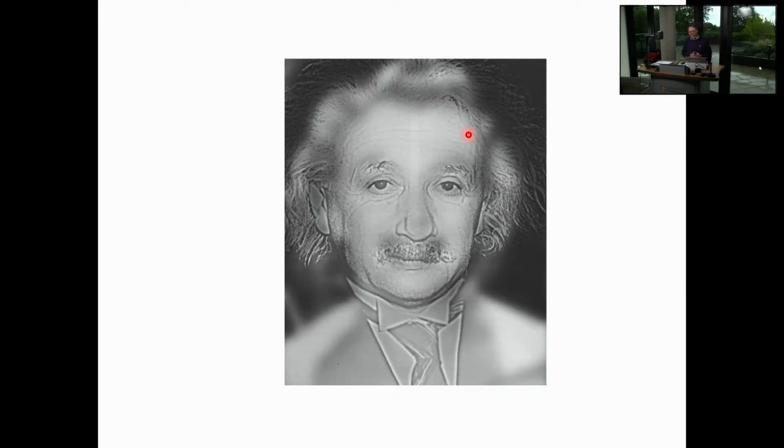And to mimic what that might do, I want you to do the following experiment. Look at this picture and then squint at it with both eyes nearly completely closed, or close them completely and then reopen them just a little bit, just enough so you admit a little light. Make the image that you can see with your eyes as bad as possible.